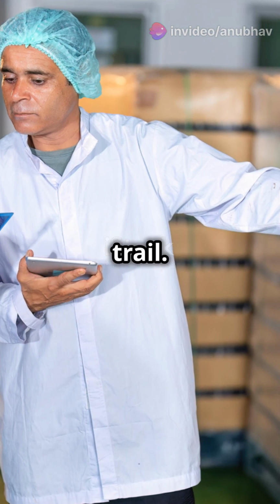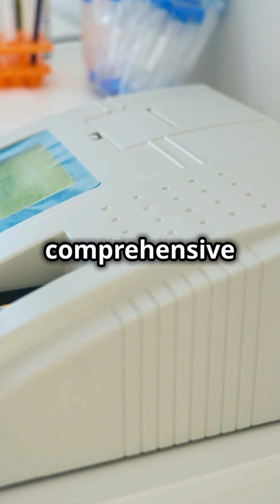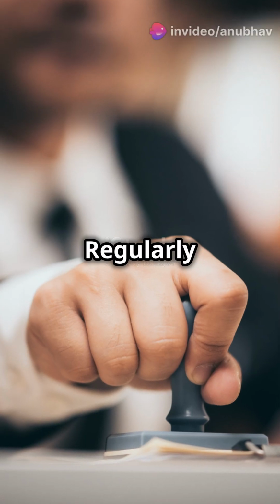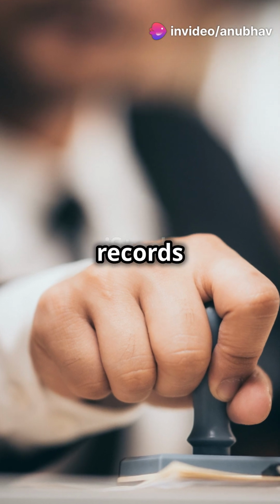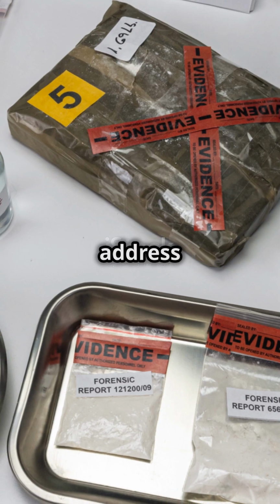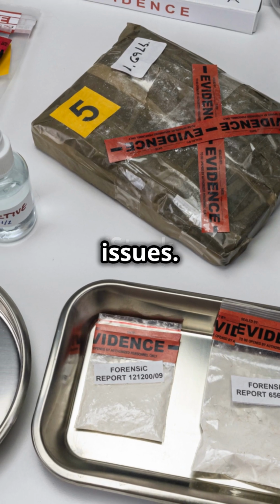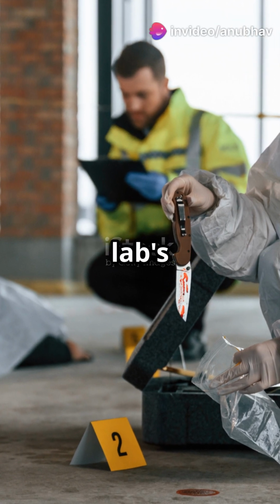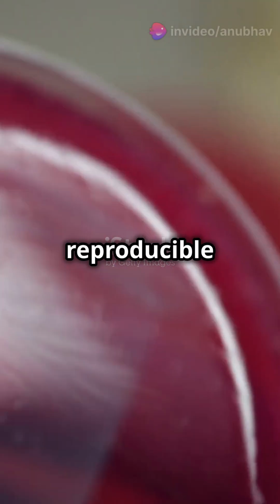Finally, keep an audit trail. An audit trail is a comprehensive record of all activities related to the sample. Regularly review your chain of custody records to identify any discrepancies or areas for improvement, and address any gaps or issues. This proactive approach helps in maintaining the reliability of your lab's processes. This ensures the integrity and reliability of your results. A well-maintained chain of custody process is essential for credible and reproducible data.